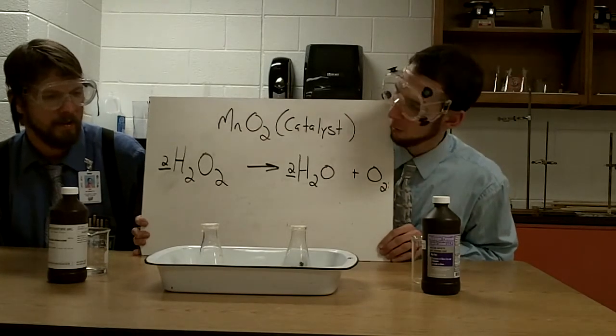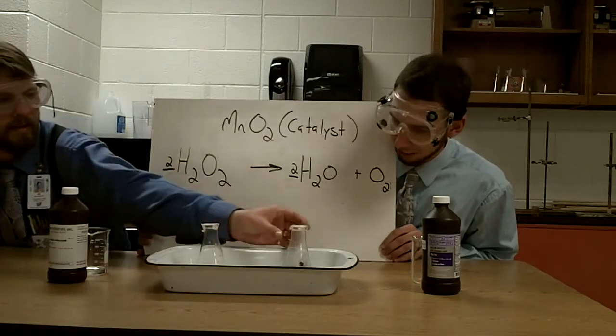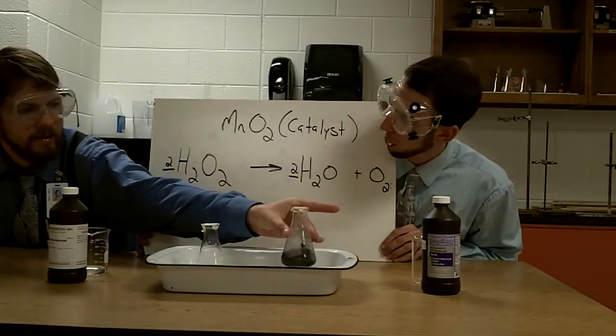3% first. Oh, there is a reaction. It doesn't appear that way. Oh, careful, it's exothermic. Oh, it's hot.